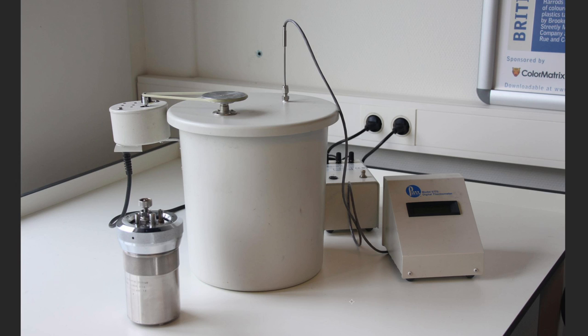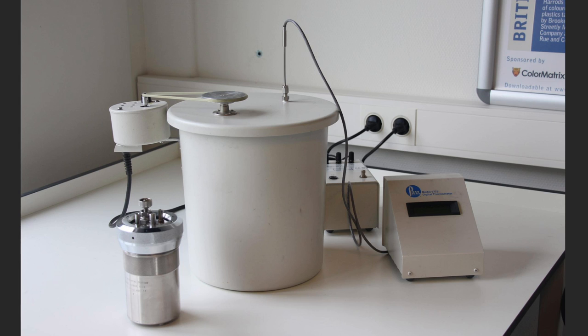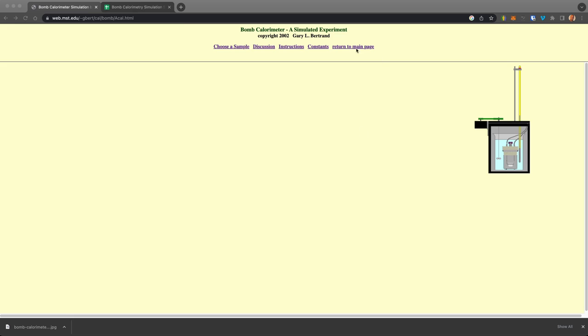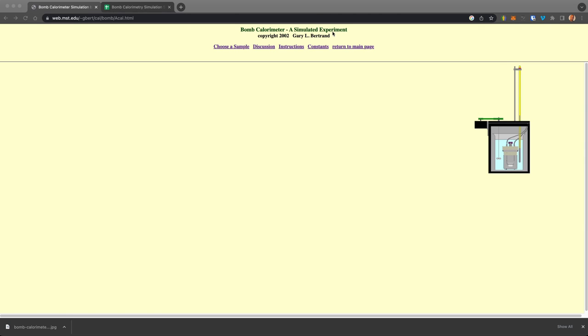So for online students doing this remotely, because of all the manual steps, is quite difficult. But we have simulators for this that are actually quite realistic in the data they give you. So here we've gone to a website where there's a freely accessible simulated experiment for bomb calorimetry.